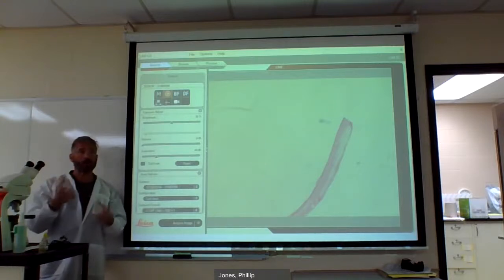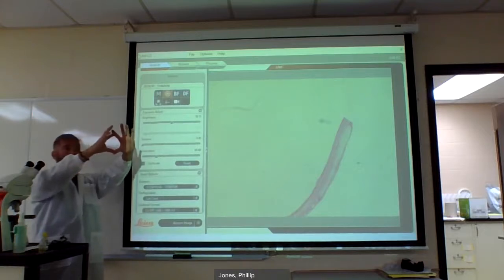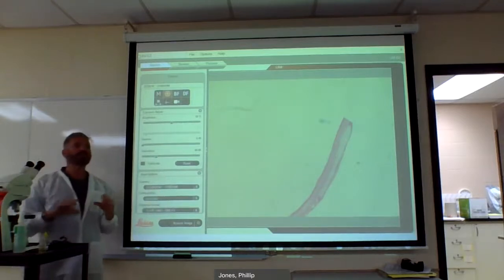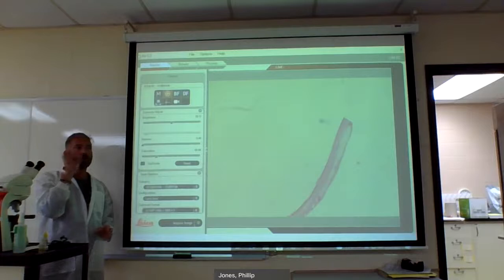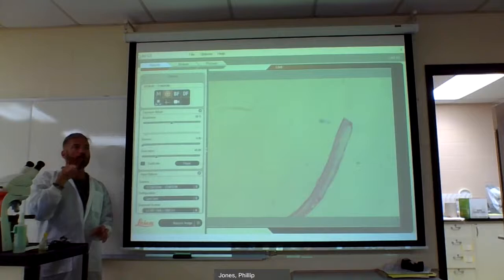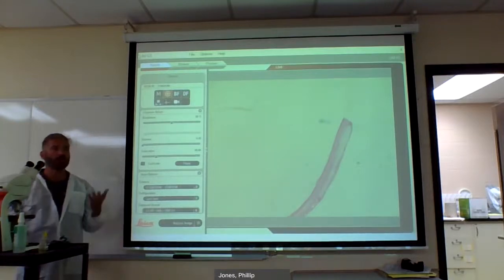Or just find your dominant eye. Hold your hands up like this, find an object, close one eye and then the other. Whichever eye lines up with the object you were looking at — that's your dominant eye. Also, on your microscope there's a diopter adjustment. If you are myopic or hyperopic, you can change this by tuning it in. What may be clear for you might not be for your lab partner.